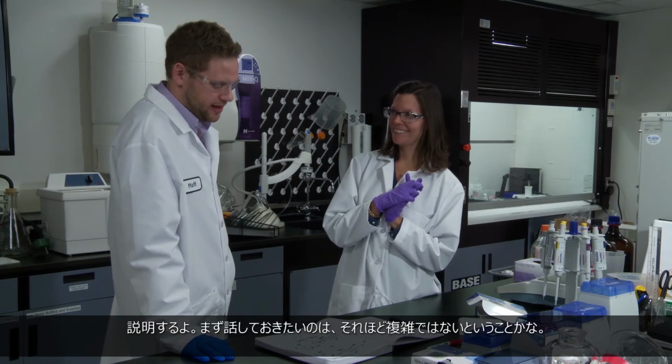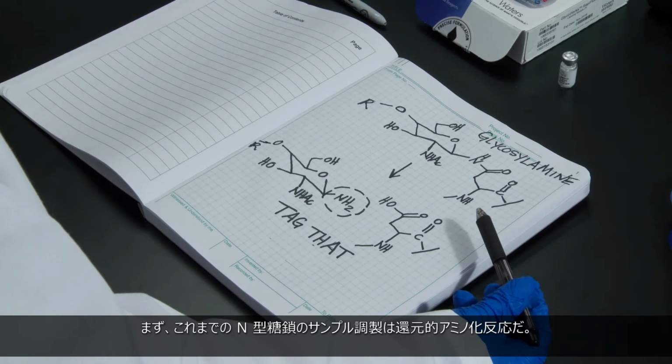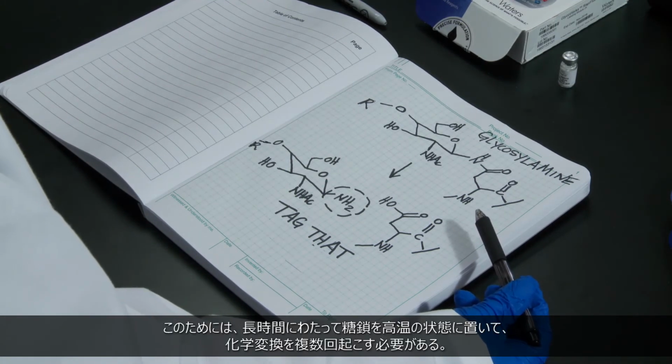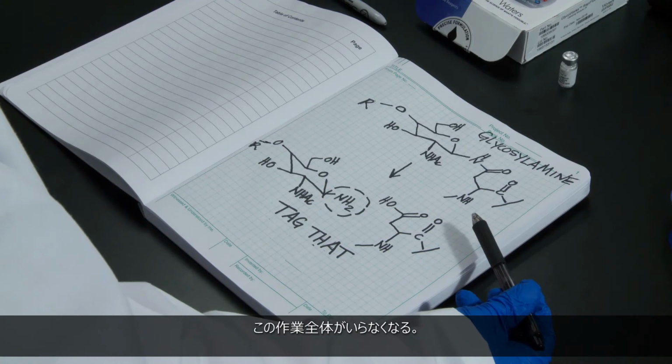protocol. Yes, it's, I have to point out, not that complicated. So, conventional N glycan sample preparation is dependent on reductive amination. This is a process that requires glycans to undergo multiple chemical conversions and a lengthy high-temperature incubation. All of that can be avoided.